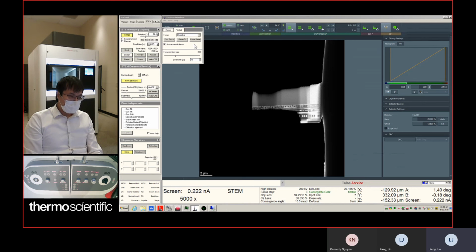In this case, you cannot judge whether your C2 is centered by seeing whether it wobbles concentrically. I will show you more detail later. So let's change it back to intensity.